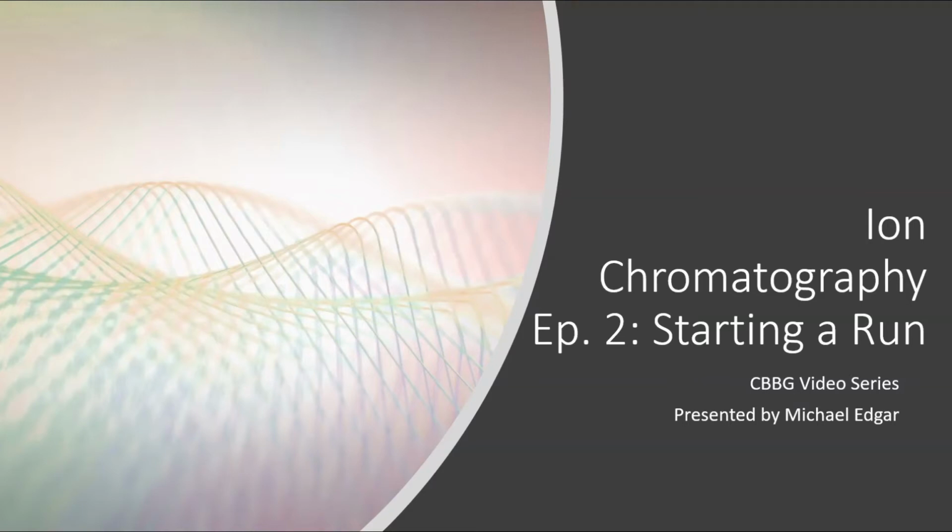Hi everybody and welcome to episode 2 of the ion chromatography video series. In this episode we're going to talk about starting a run. So let's get into it.